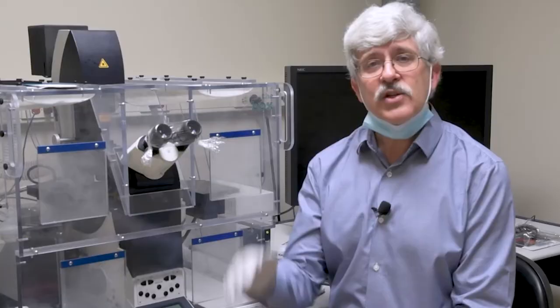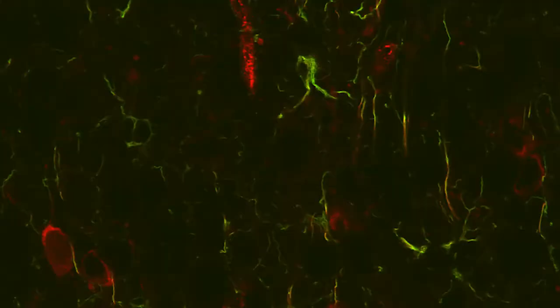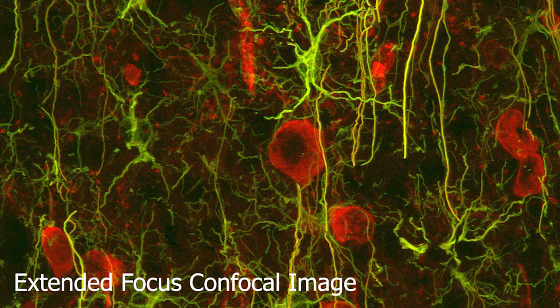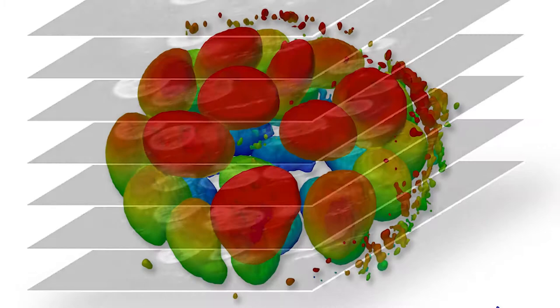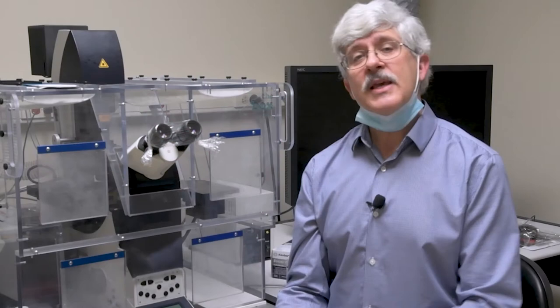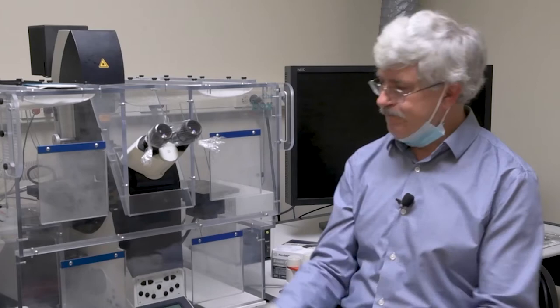The second reason has to do with the way confocals work. You're focusing visually through a cell or other material and creating very thin sections. These sections are clear and sharp, especially at higher magnifications, giving you a better image than a wide field system. The third reason is you can create a 3D reconstruction of your cell by taking a stack of those images. So assuming you have something appropriate for this, let's get started.